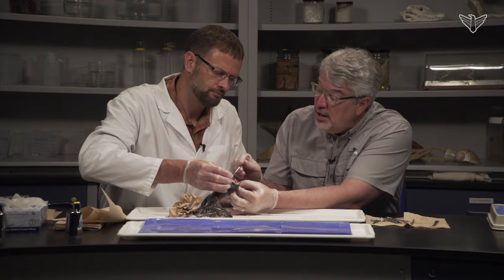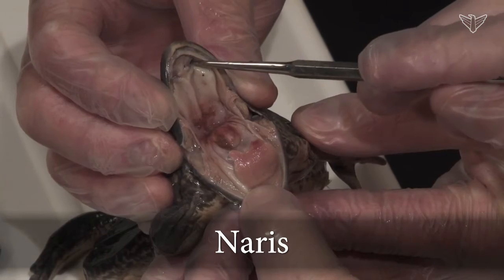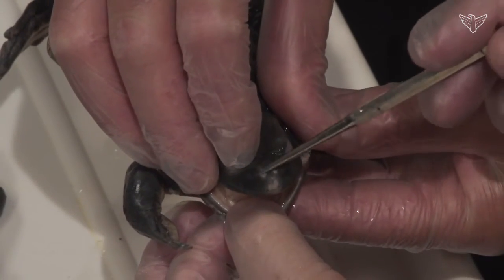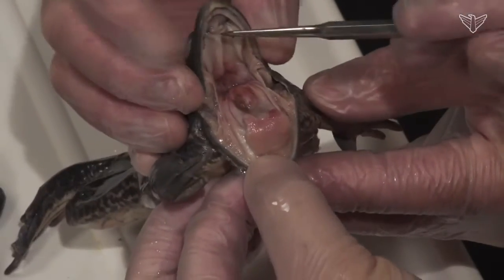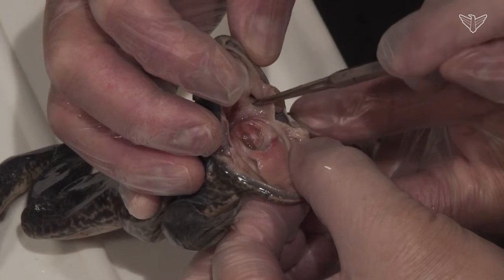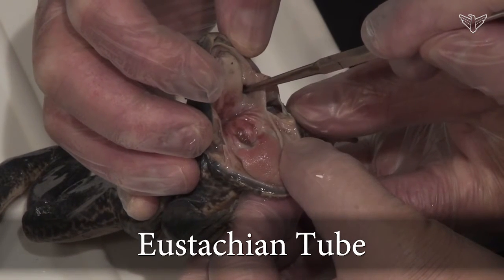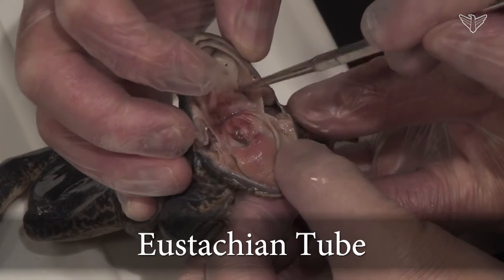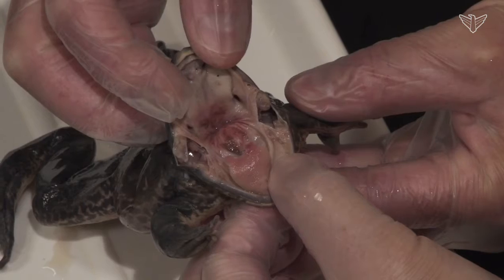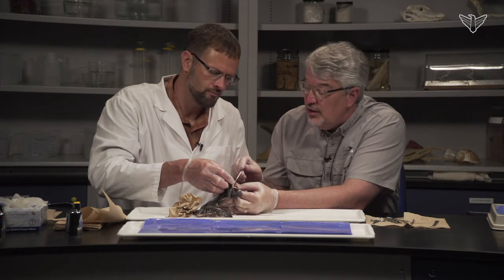And then there's the nares here. These are the internal nares, so they open from the nose, since they have paired nostrils, and those open into the mouth area. And then a little harder to see back here, there it is: the Eustachian tubes, which are internal openings to the ear. Those are paired, yes. There's one over here. Those equalize the pressure between the inside and the tympanic membrane, to the inner ear.